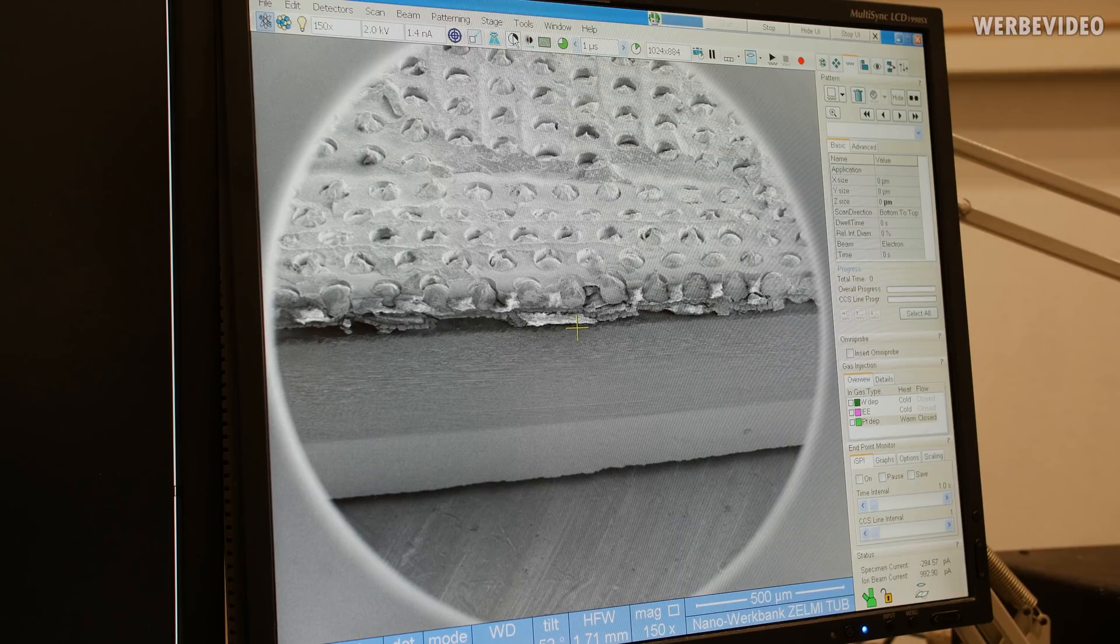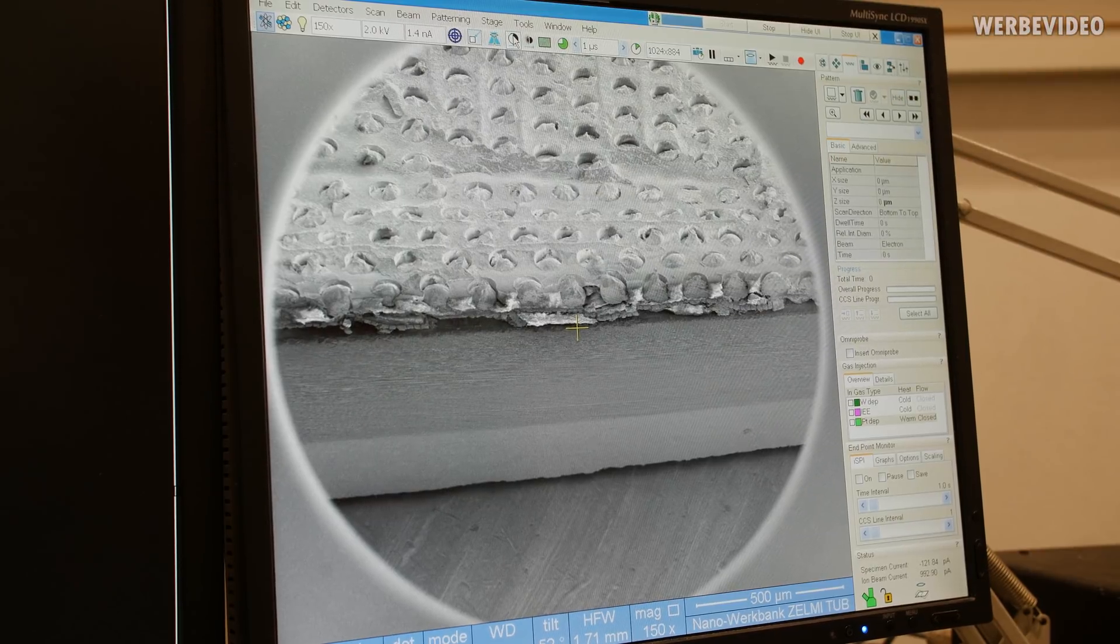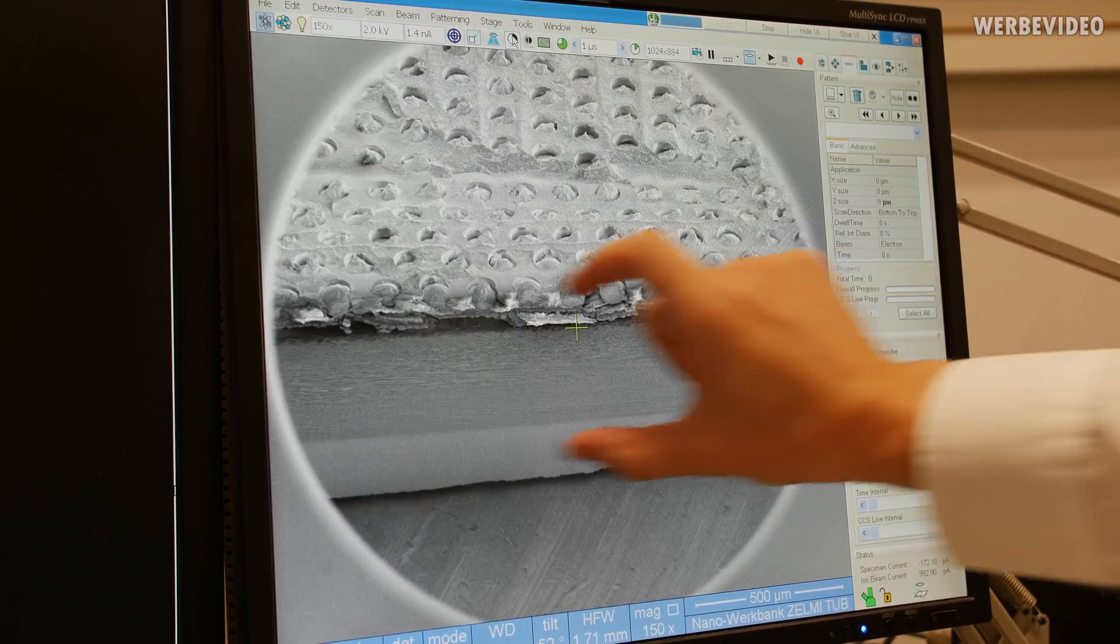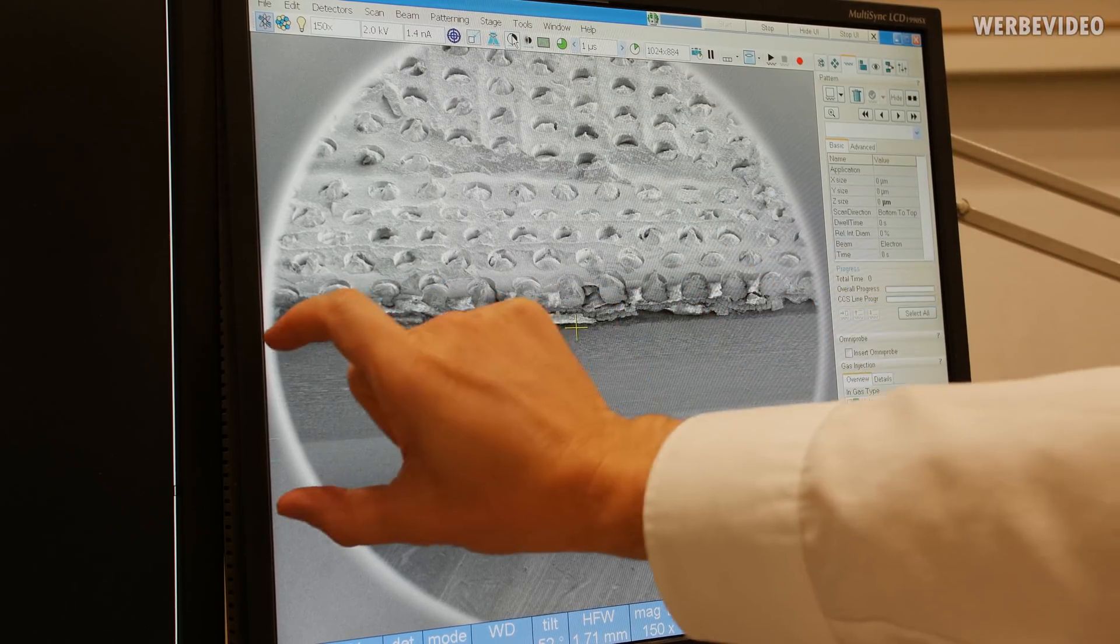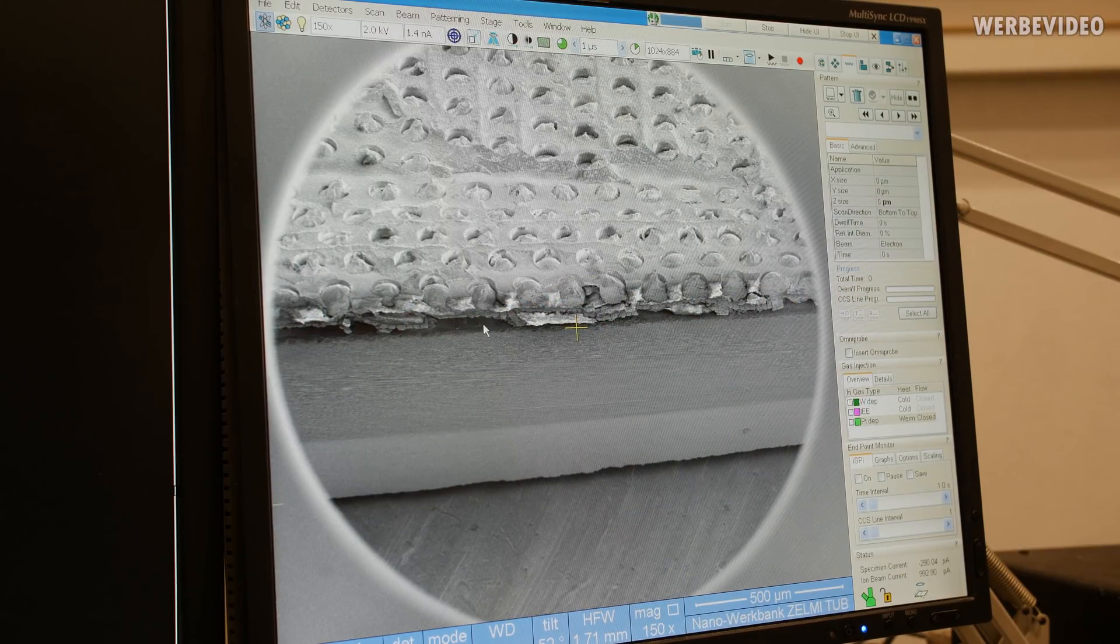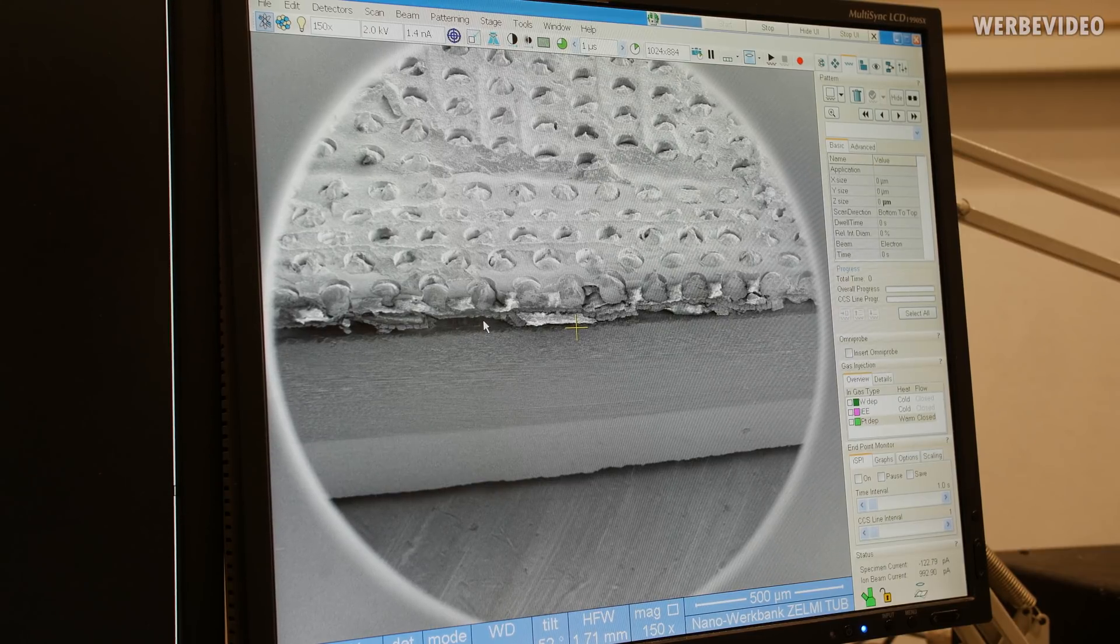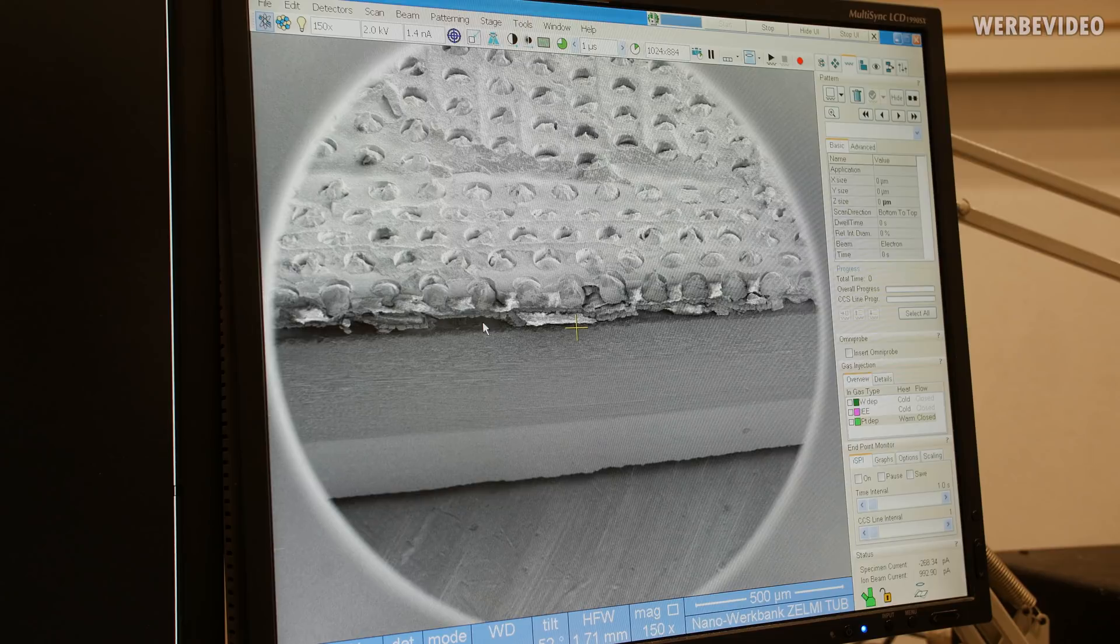The specimen is inside of the SEM and you can still see the surface with the solder bumps. Below here, this is a silicon wafer. And on top of the silicon wafer, we have these semiconductor structures that we want to investigate later in the TEM.